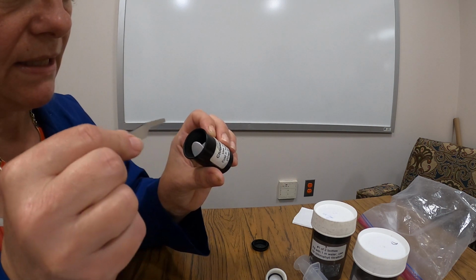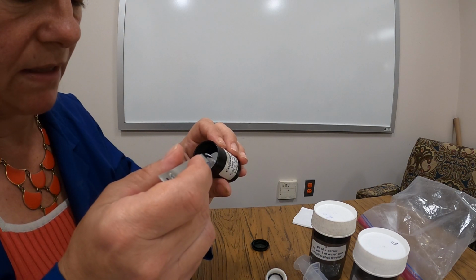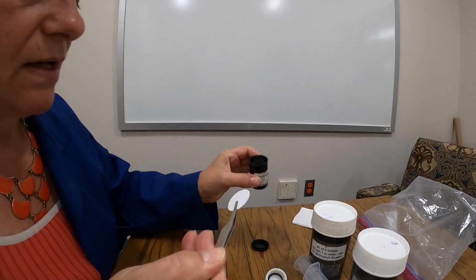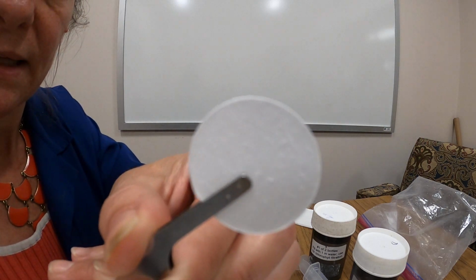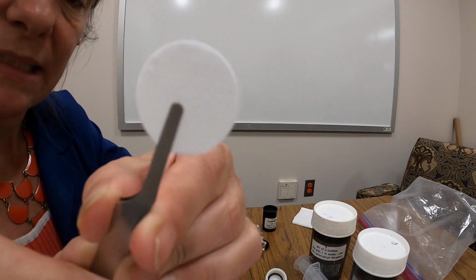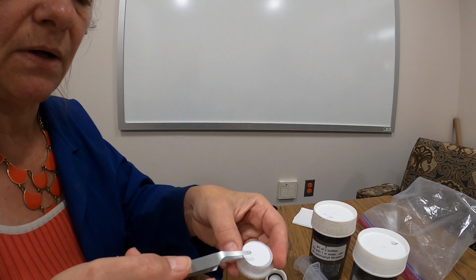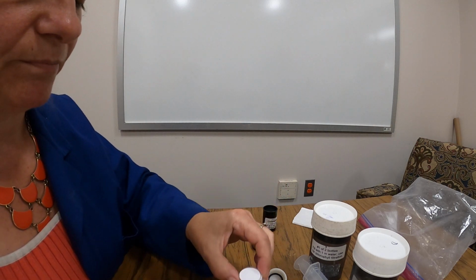And these are pretty thin filters, and they often get kind of stuck together, so you may have to poke around a little bit to make sure you're getting only 1. And then these filters often have a rough side and maybe a little smoother side or a grid side. We want to have the rough side up, or the grid, the smooth side to the screen. So I've got my filters in place.